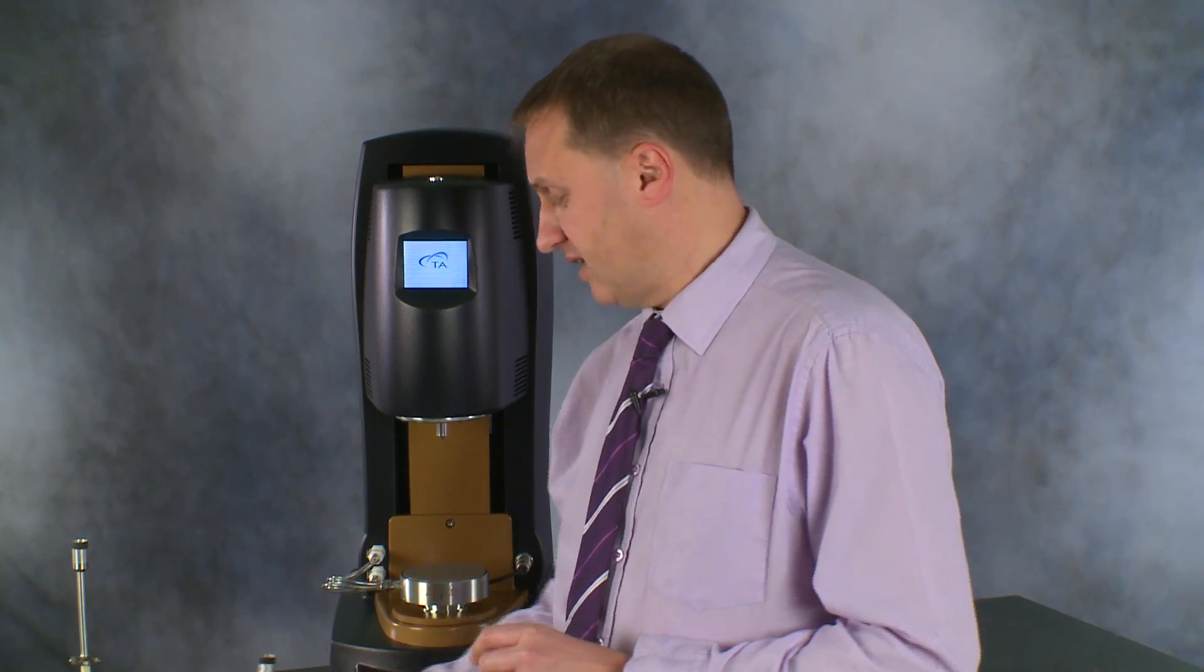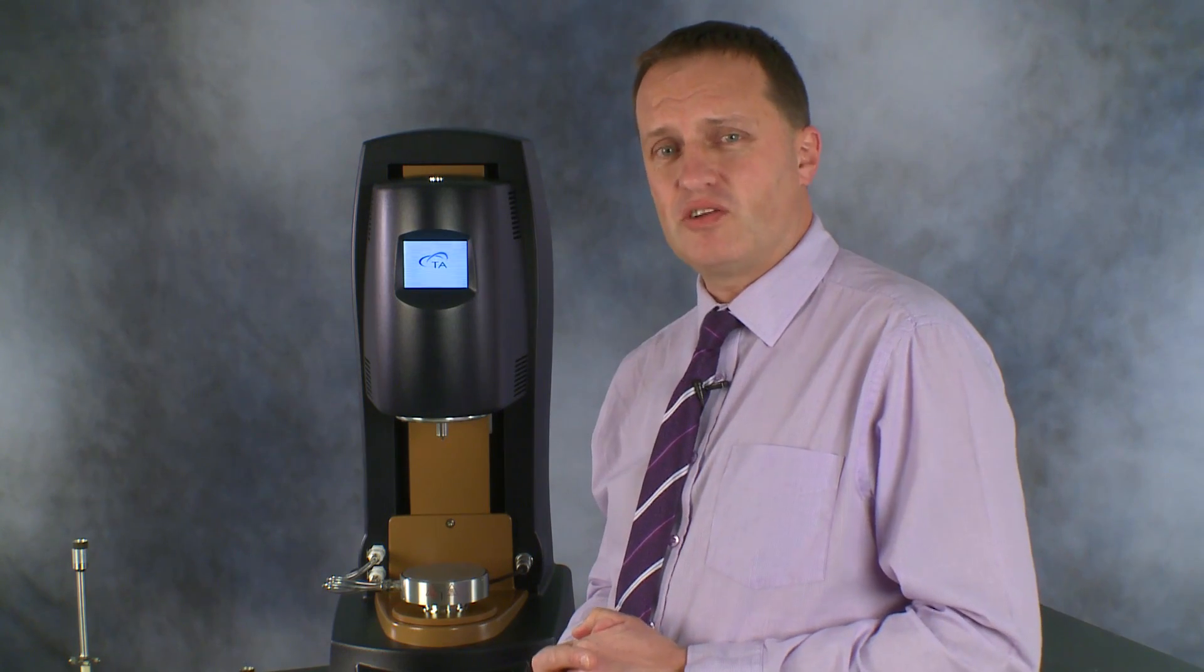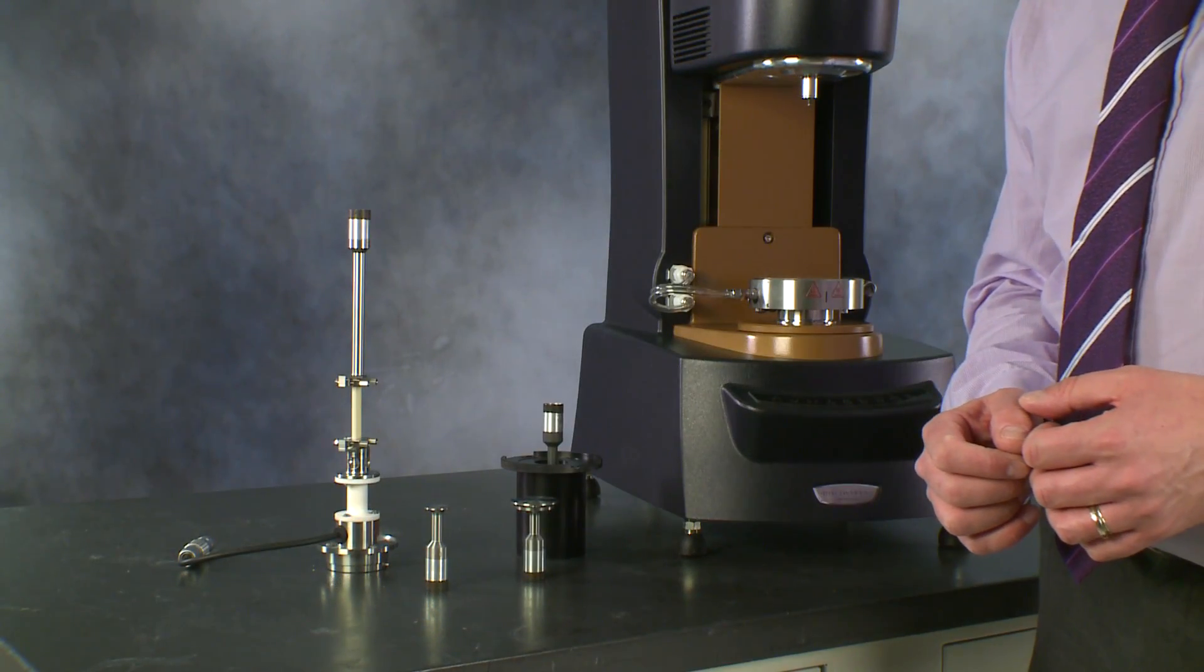Concentric cylinders are historically the best choice for people who've come from viscometer ranges, but they're not necessarily the best choice for doing tests. So that's when we move to cones and parallel plates.